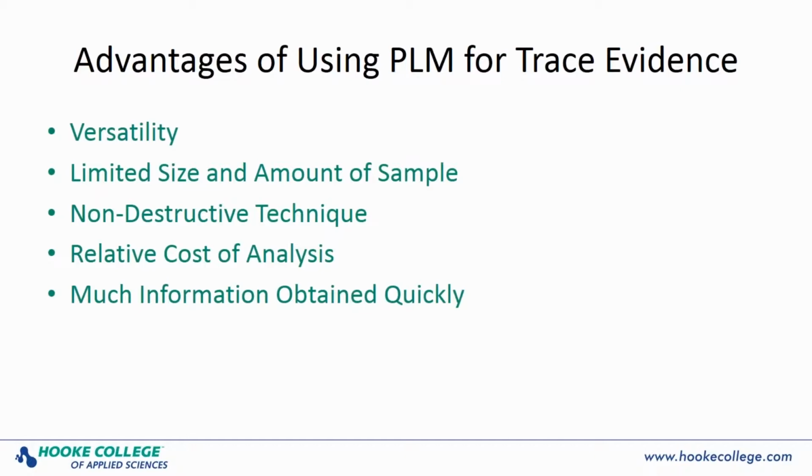Even when the microscope does not answer the ultimate question at hand, if used in the initial stage of an investigation, a lot of chemical information and possible source information can be obtained very quickly, leading to a more efficient use of resources and a more rapid turnaround time.